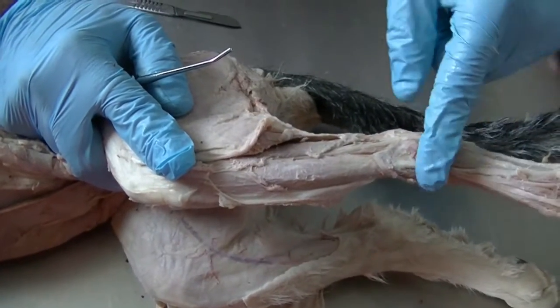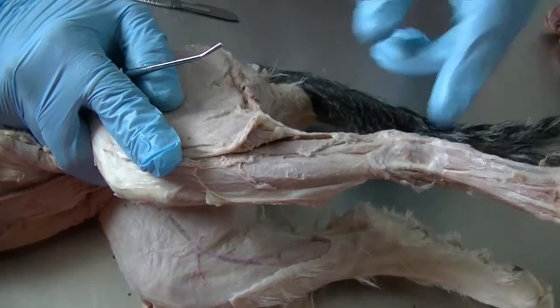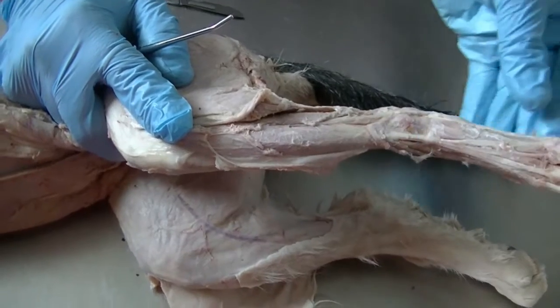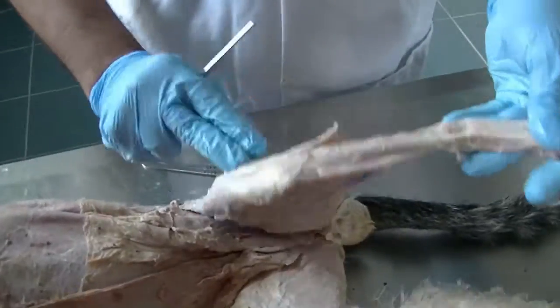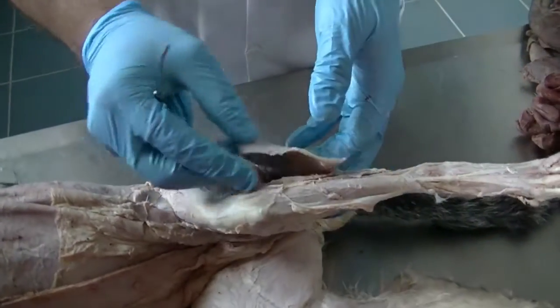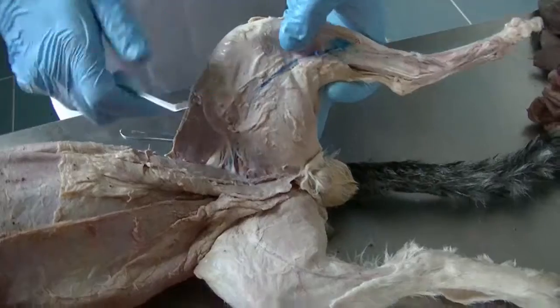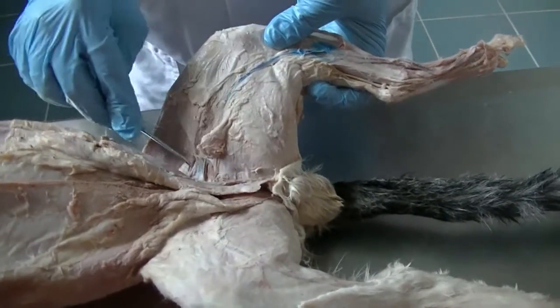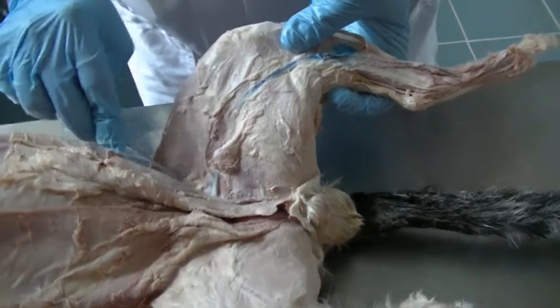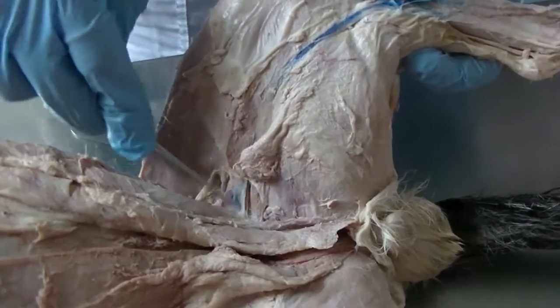Both of them would be anastomosing on the dorsal aspect of the tarsus and collecting blood from the dorsal and plantar aspect of the digit, bringing it back to the femoral veins, as both of them go on both sides. Okay. So we see the medial saphenous vein. We can see the femoral vein, femoral artery, as well as femoral nerve in the femoral triangle, as we saw in the dog, and the rest of the other structures are quite similar.